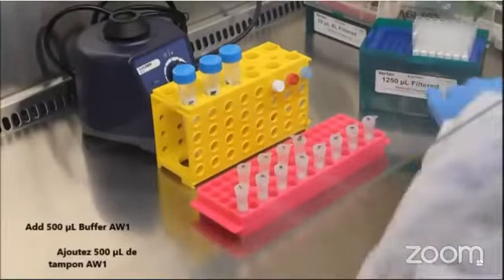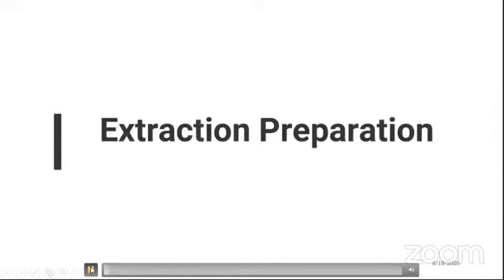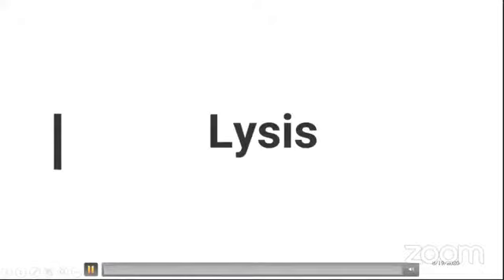After incubation, the next step is the binding. So now the lysis step is completed after the 10 minutes incubation. Now we are at the step of the binding.